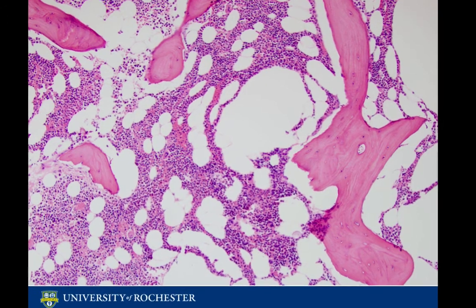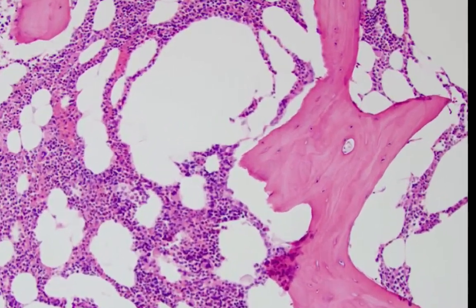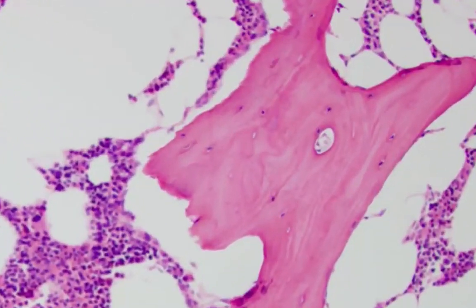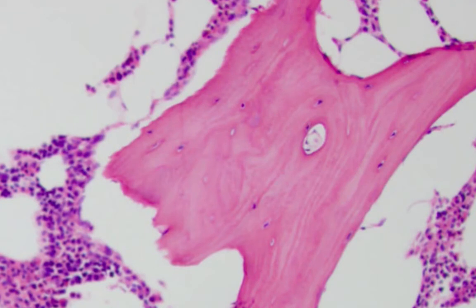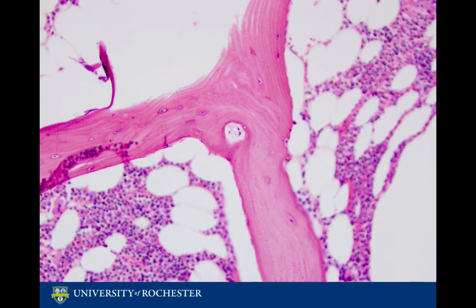Taking a closer look at the trabeculae, we'll see that it has a hardwood floor pattern, and this is made up of type 1 collagen fibers. When we zoom into a 20x image of the trabeculae, we'll notice bone cells called osteocytes that appear to be trapped in these little pockets called lacunae.